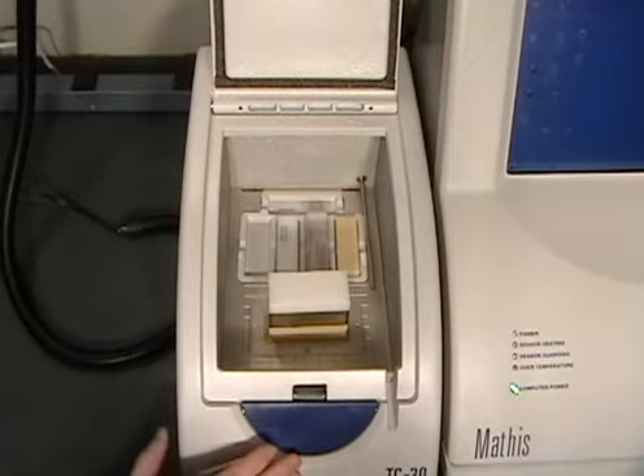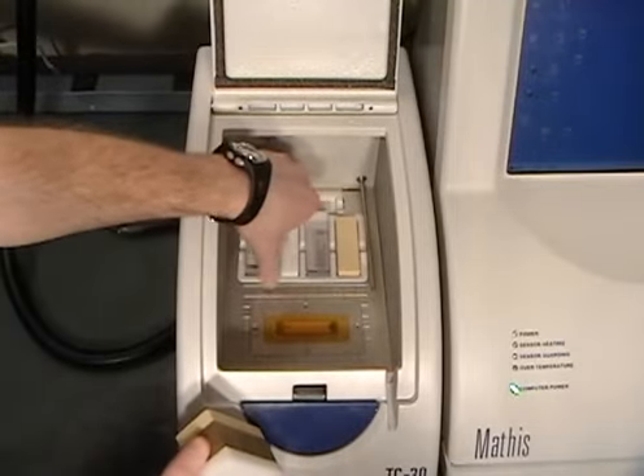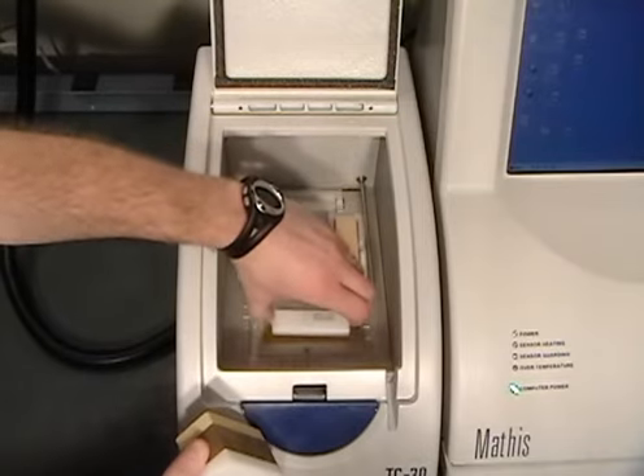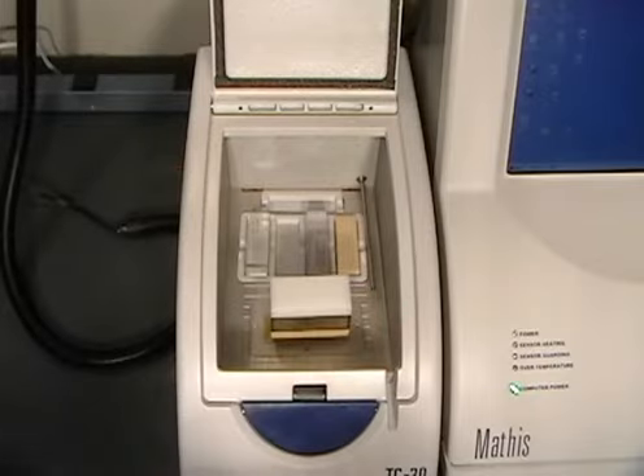Once you have selected your new reference material in the software, open the chamber lid and change the reference materials. Remember, you must wait 5 minutes before proceeding with the next test to allow isothermal conditions.